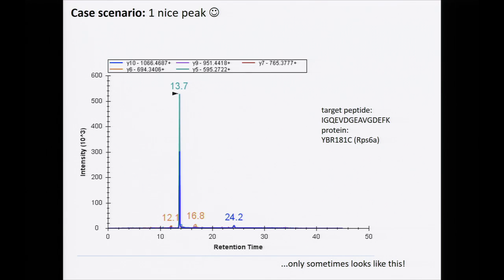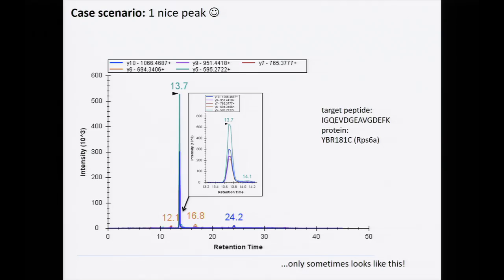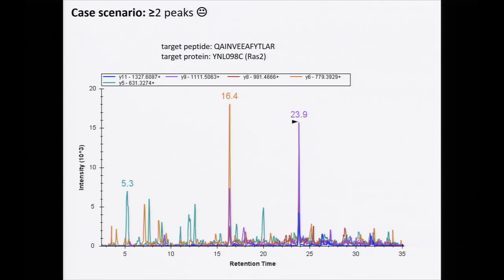This is the type of data you may have seen in your SRM tutorial this afternoon — it looks pretty nice, a simple peak, flat chromatograms, nice coelution of the peak traces. But only sometimes does your data look this clean. I'm going to show you a few cases where it gets more tricky.